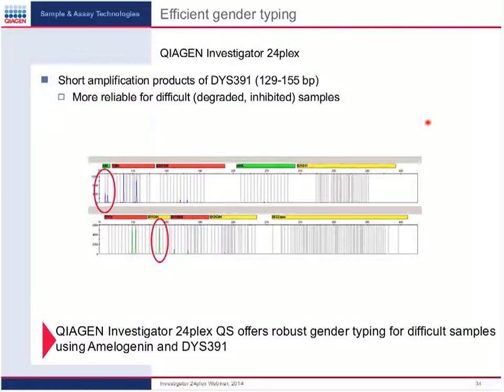In my point of view, gender identification is a very important attribute for the police to identify a certain suspect. Therefore, in my opinion, it's very important to get the right results for gender identification. This is not a scenario that is reported very often, that there are mutations in the amelogenin gene, but from time to time there are cases reported.